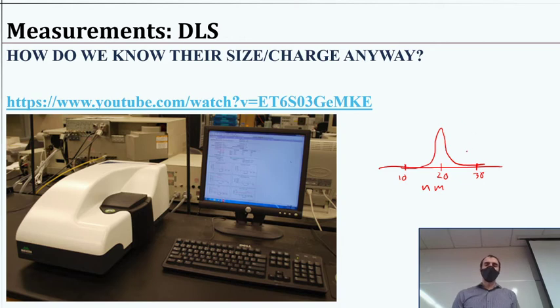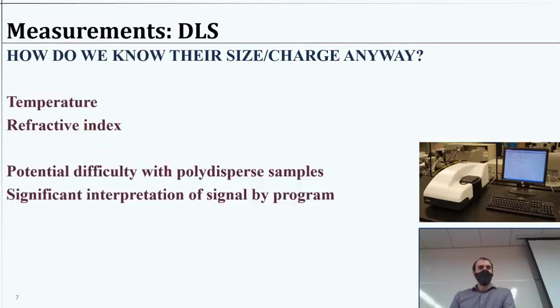determining that. So you can actually look at different viruses because they will exist as particles in solution, and you can get a pretty good estimation. If you were to take the coronavirus and look at it under the DLS, they're smaller than you can resolve with visible light for microscopy. So you can't image with visible light that way, but the particles can still scatter the light. So that's why you're able to, like they said, even get potentially below nanometers, they'll still be scattering some light. So with the right conditions, you can get pretty low ranges in size.